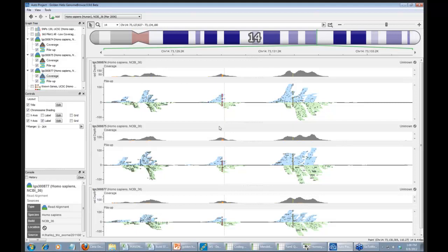Instead of getting our de novo polymorphism candidate list down to about 5 per trio, we were around 15 to 20. Initially we were validating all of those, and we found that if we didn't filter on the child, our success rate in validating de novo SNPs was less than 10%.